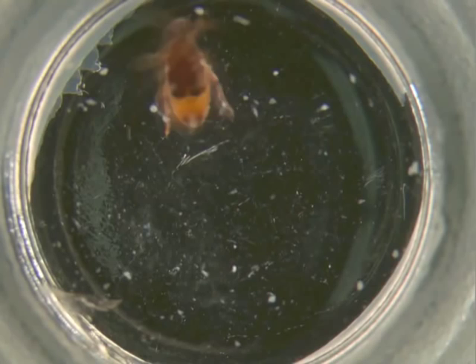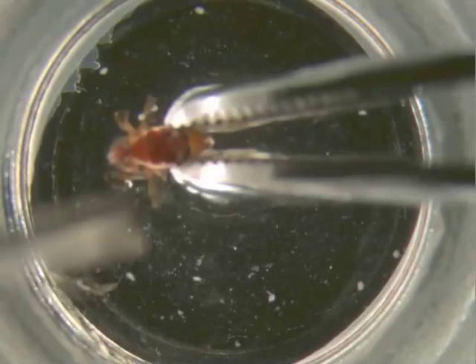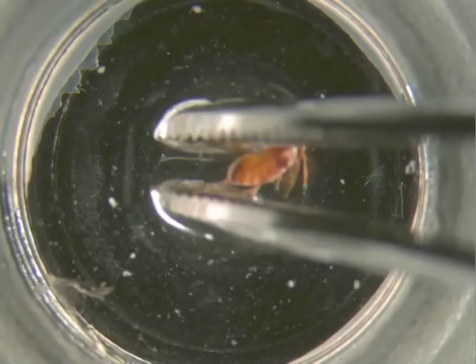Place a female bean beetle into the dissecting dish in the PBS. Then use the larger size forceps to grab the beetle. Grab the abdomen with one set of forceps and the head end with the other forceps.